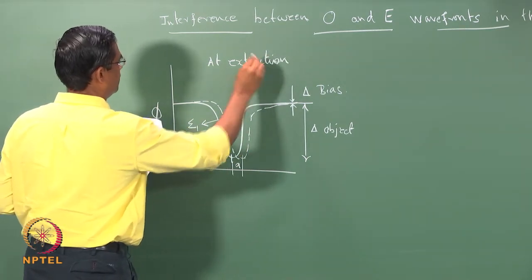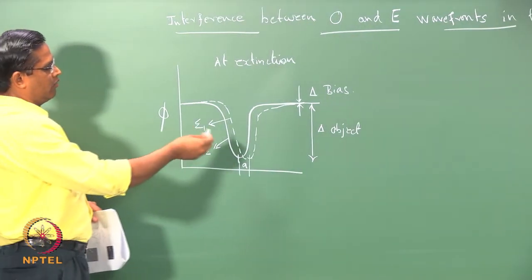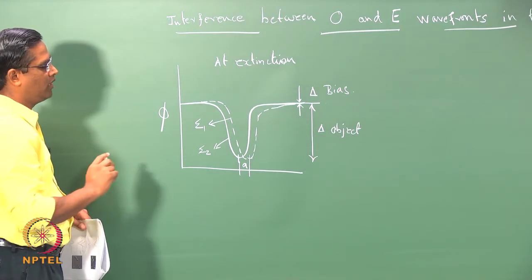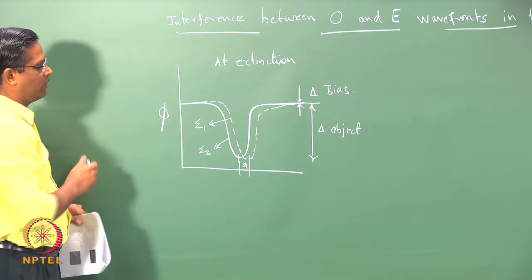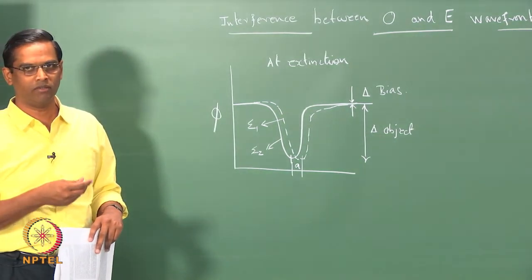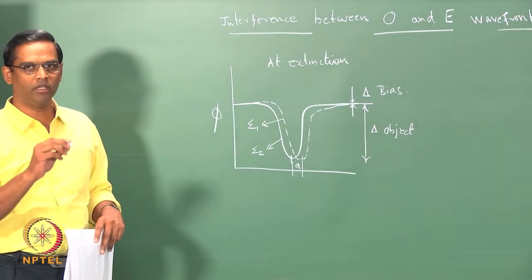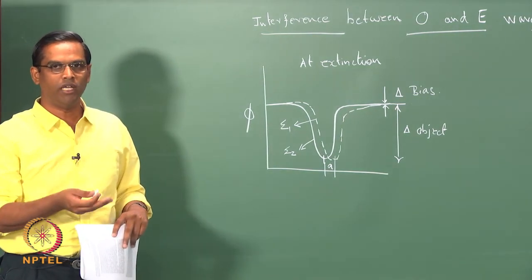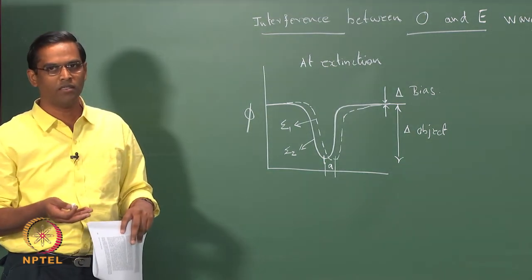That means your polarizer and analyzer are in mutually perpendicular directions. And we have also seen in the polarized light microscope as well as the DIC microscope, if you turn the analyzer to the particular orientation, you can see only a dark background and there will not be any image contrast.